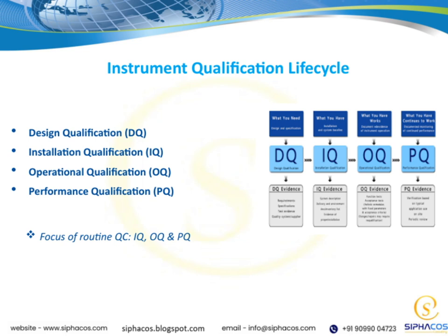Finally, we have performance qualification, or PQ, which demonstrates that the instrument performs reliably and consistently in real-world conditions over time. Together, these stages form a comprehensive life cycle that helps us maintain quality, compliance, and confidence in our instruments throughout their operational life. This structured approach is vital to our overall quality assurance strategy, ensuring that every piece of equipment contributes to accurate and reliable results.